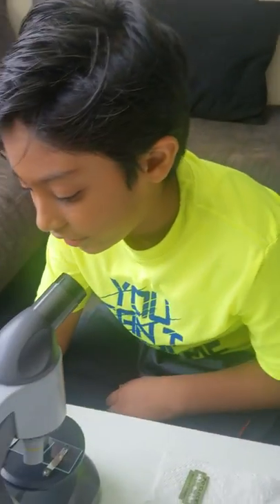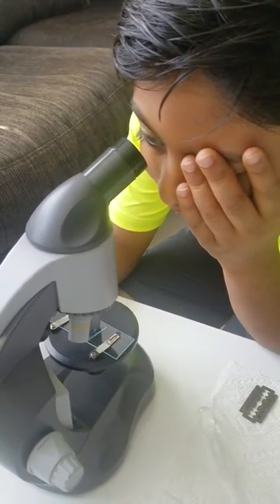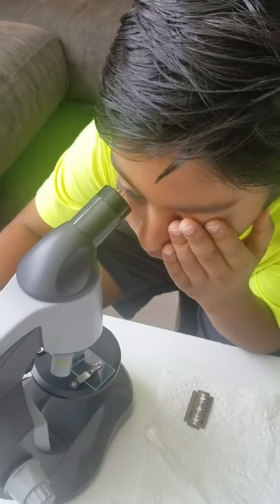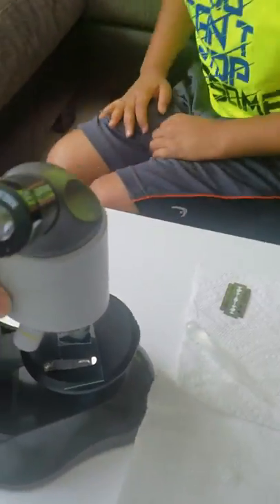You won't be able to see a nucleus. This is still our first slide — we haven't moved on to the second yet. So this is at 800x. Right there — we can see at 800x. All that green is the chloroplast. And those things that let you tell which one is one cell and which one is another — that happens because of the cell walls. Those kind of black or purplish things are the cell walls, and inside are the cells.